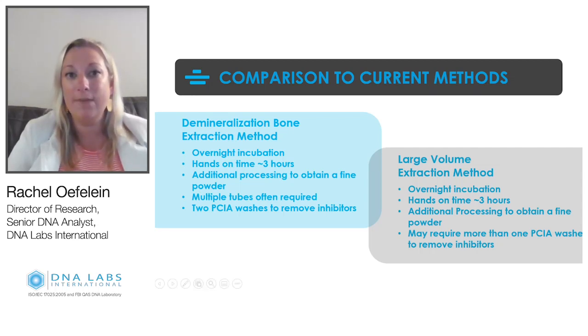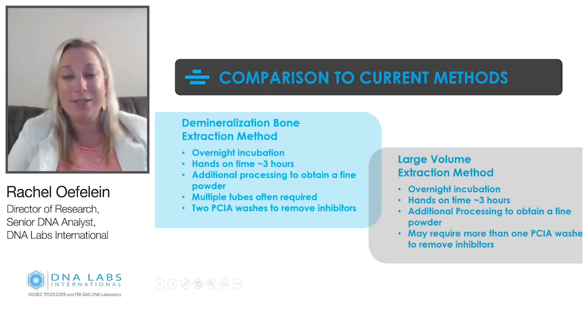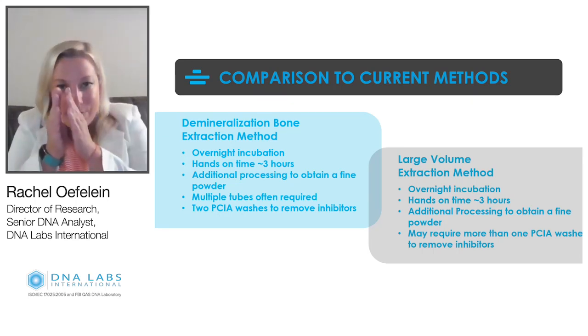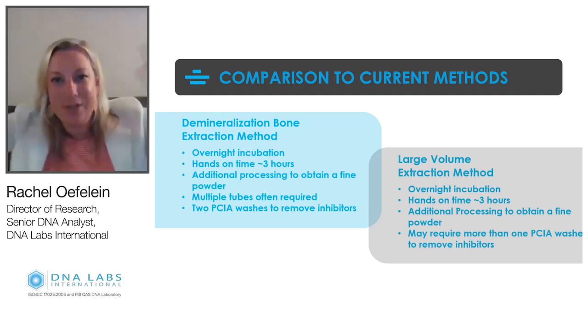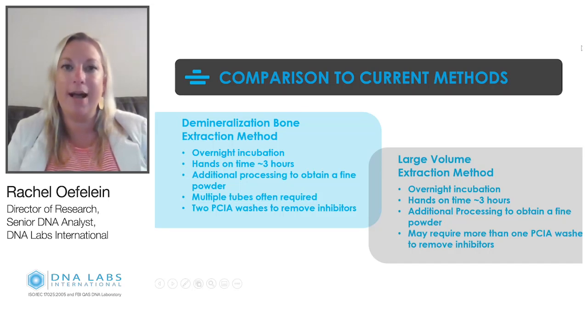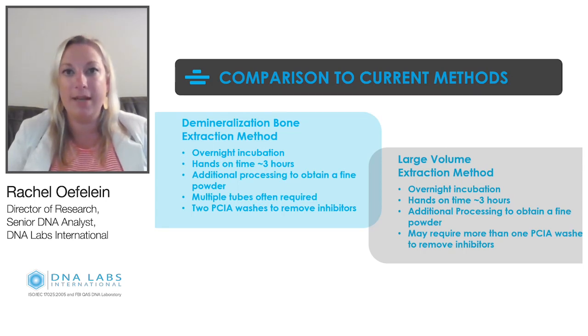We were finding for our investigative genealogy cases that sometimes we were having to do 2, 3, maybe even 4 extractions to get enough DNA to go forward with genealogy. So I don't know if you can see in the tiny camera, but DNA for a CODIS STR profile, you need this much, whereas for genealogy, you need like this much. It's a lot more DNA. So we wanted to bring on a method where we could get higher return DNA from our extraction yields and hopefully limit having to do multiple extractions.